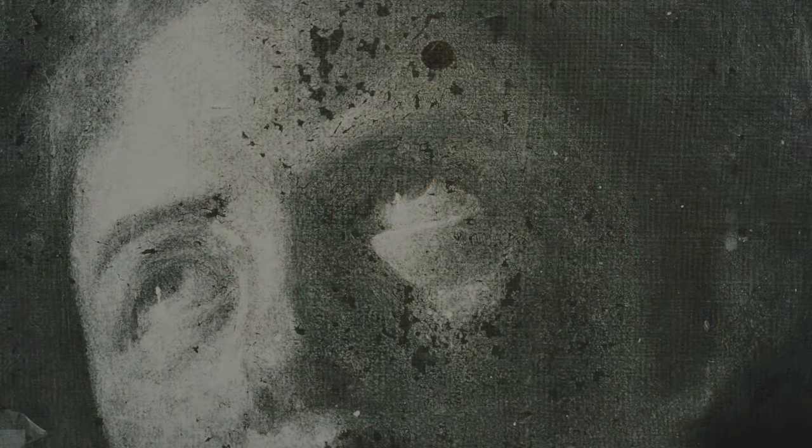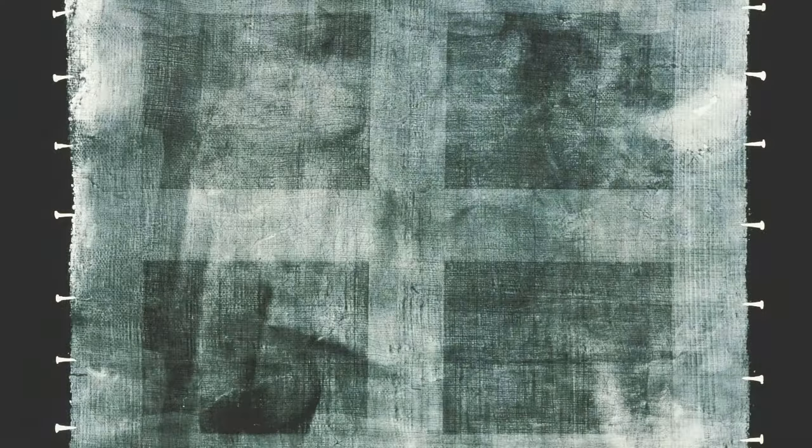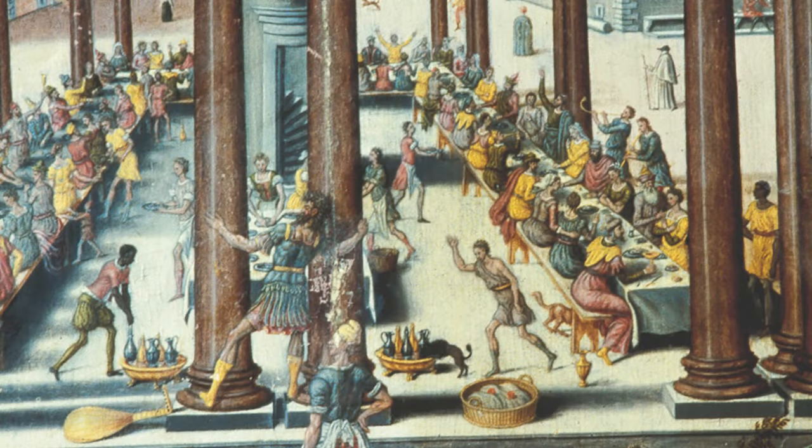It can give us insight into certain internal structures or the artist's hesitation, known in French as repentir. Finally, and most spectacularly, the technique can reveal the presence of a hidden painting underneath. Radiography can be used to create an authentic archive document for the holder in case of theft or loss. For this reason, the image should accompany any certificate of authenticity.